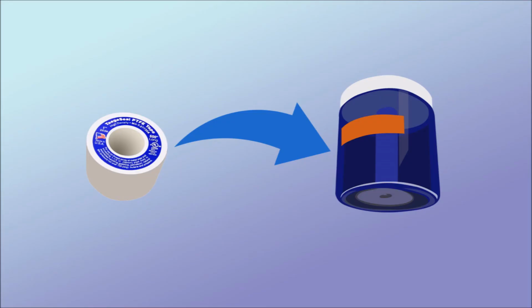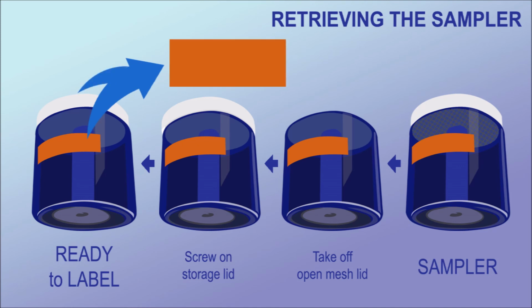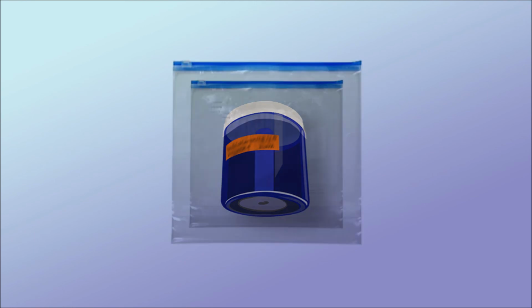Wrap Teflon tape twice around the top of the sampler between the cap and the jar and press down the end firmly. The sampler is now ready to label. Label both the side of the blue housing and the storage lid, writing the location, the date deployed and date collected, and the time deployed and time collected. Put the sampler in 2 layers of Ziploc bags.